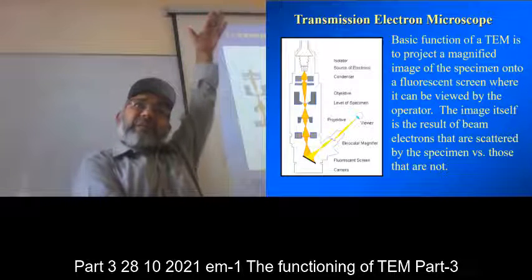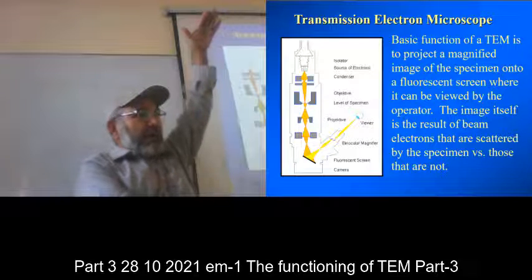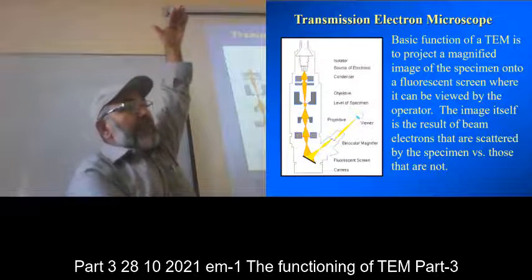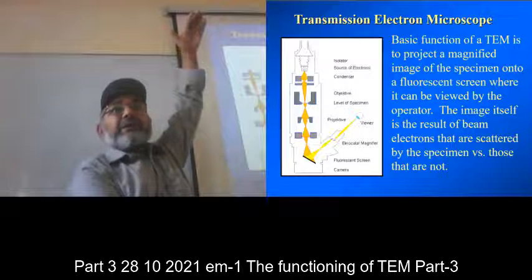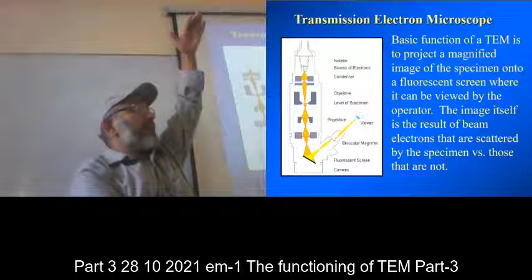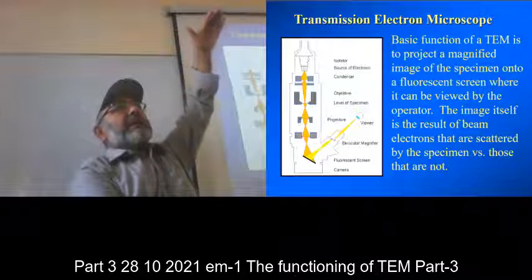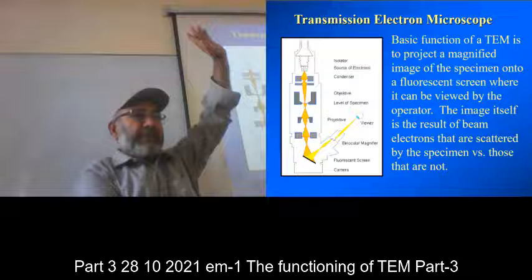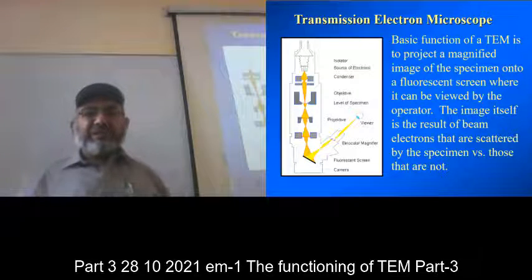By displacing the film level up and up, you can increase the magnification 100 times. And there are different levels. I will explain them in the later times, but a time will come that we will discuss these.